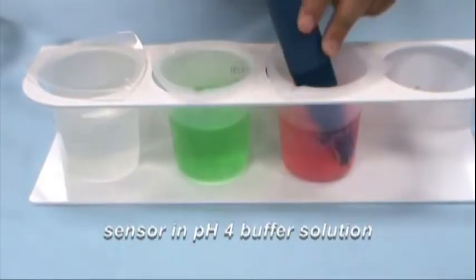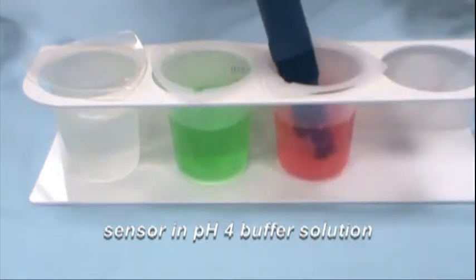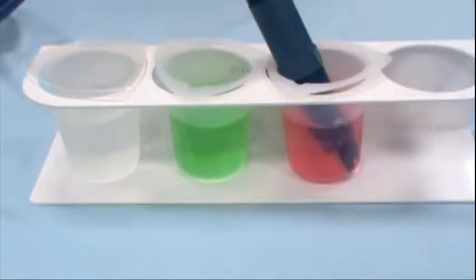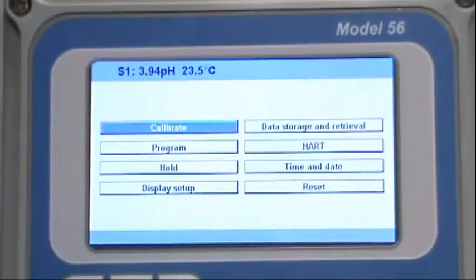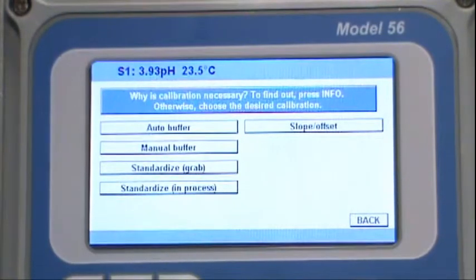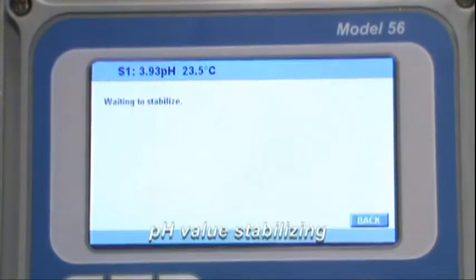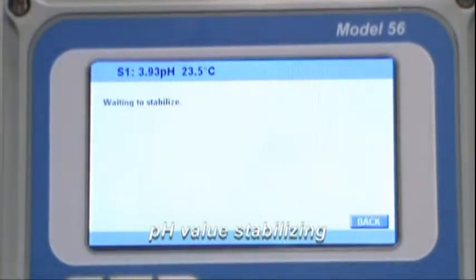Place the sensor in the first buffer solution. In this example, pH 4 buffer solution is being used. Wait for the value on the pH instrument to stabilize. If the sensor is not cooled to the same temperature as the buffer solutions, the stabilization time may take longer than expected, or the calibration may not be successful.